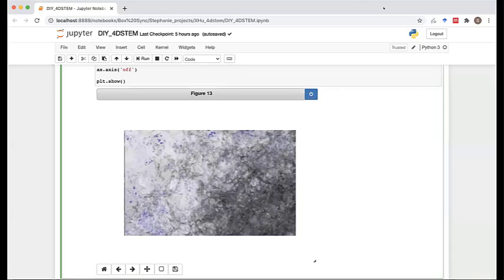And another thing here, if you want to comment on, is that in terms of speed, it depends on what kind of mathematical functions you are applying here. I think that answers the question, because in terms of speed and usage of memory, it depends on what functions you're using.